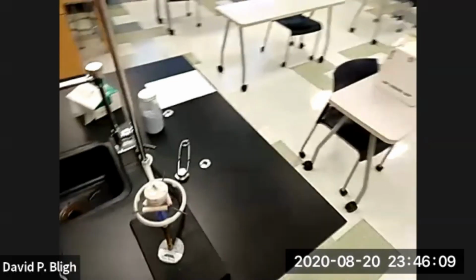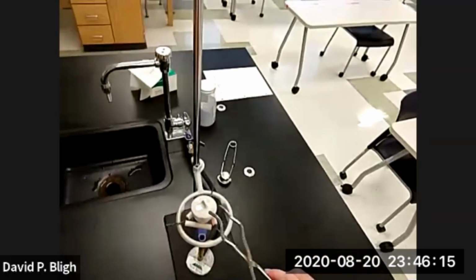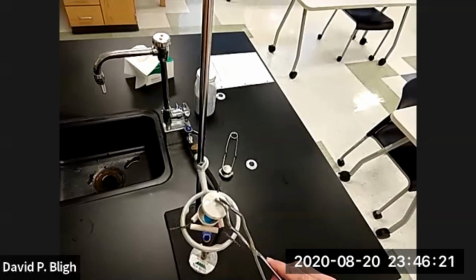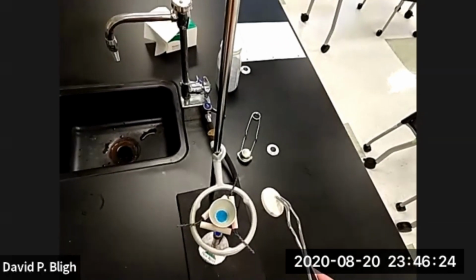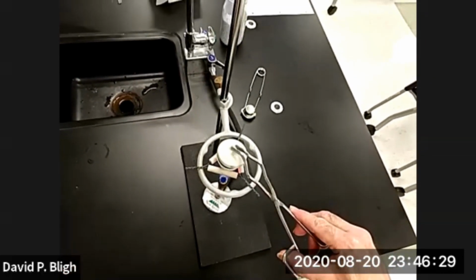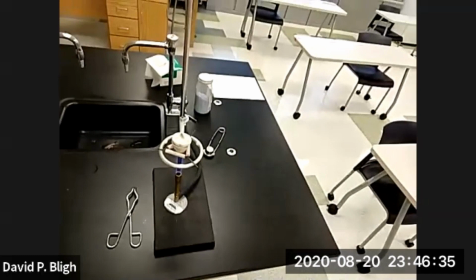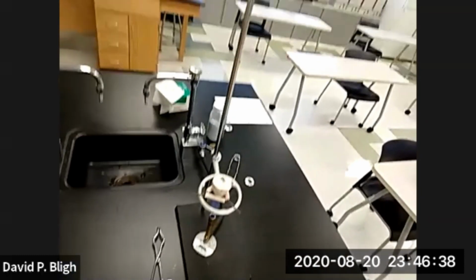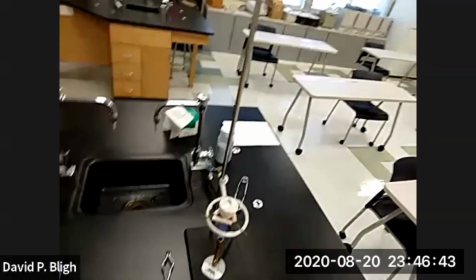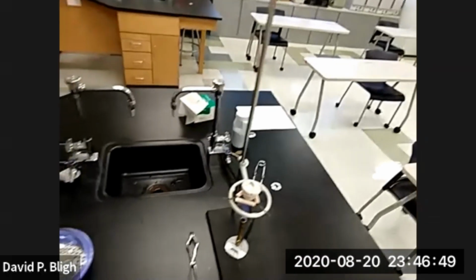Remember, the material started off blue, right? If we look at it as it heats, it's already around the edges started to lose that blue color. Okay? That's what's nice about copper sulfate hydrate, is that as it heats, it loses the blue color because the water, well, it's a long story, but the water makes it turn blue. That way you can tell when it's finished heating, even if you don't wait for 10 minutes.